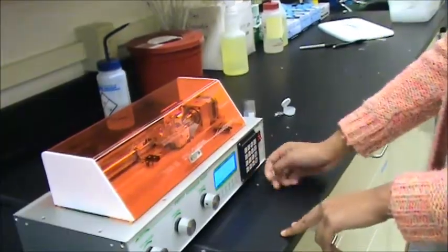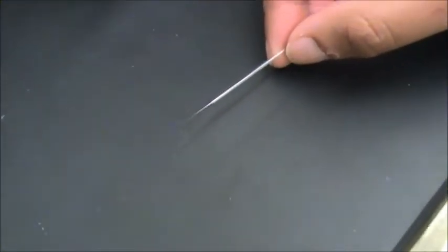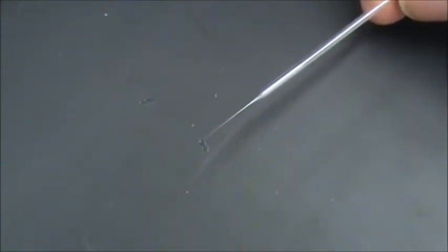It could be pull 1 or pull 2. So this is the final microelectrode. You can see that it's pretty sharp at the very end.